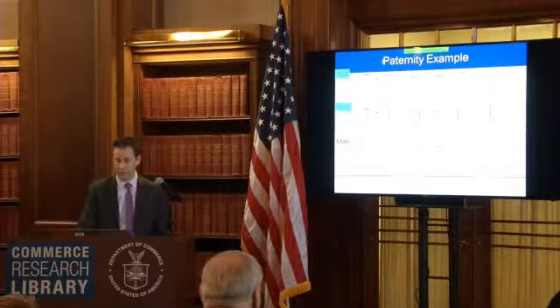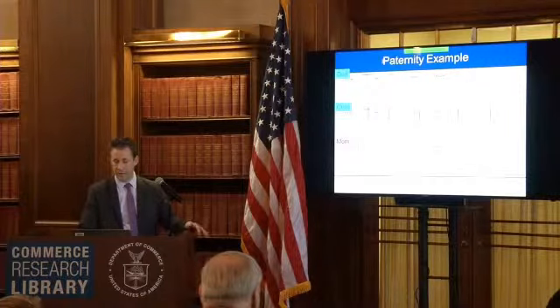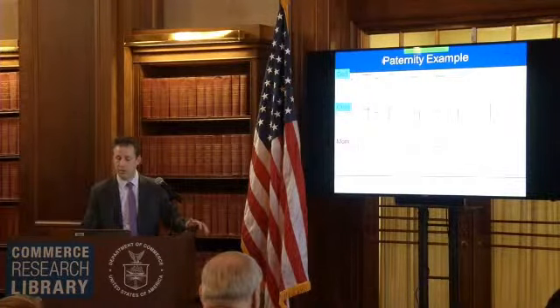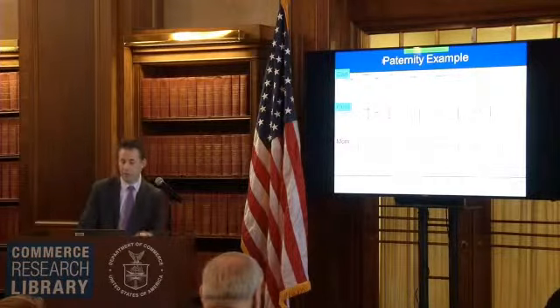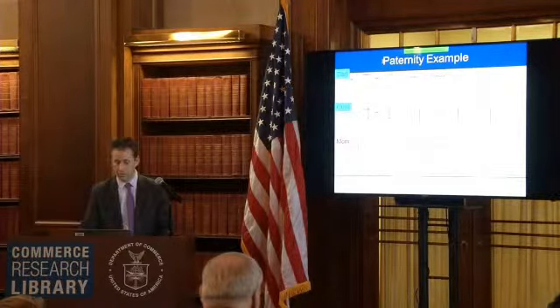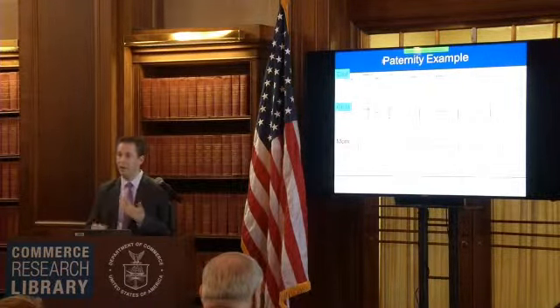In this example here, the father was a 6, 6, so both of his chromosomes had a 6. The child is a 6, 7, and the mother is a 6, 7. But since the father doesn't have a 7, he had to get the 7 from his mother, the 6 from the father. So you can go through there and see that the child is always a composite of the two parents.